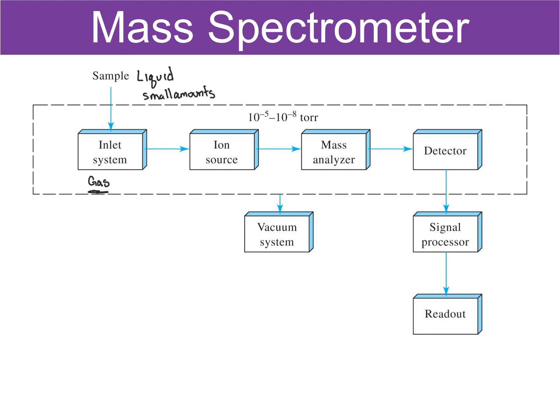And all of this is under vacuum. So that means very low pressures. That's not how you spell vacuum.